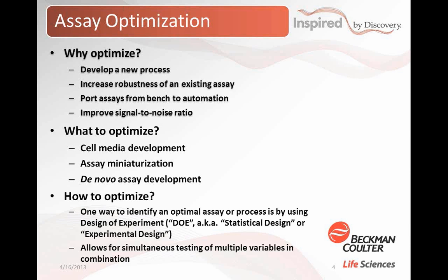One of the methodologies, and the one we're going to talk about today to do optimization, is called design of experiments. Traditionally, there's no S on the end, but it's easy to throw that in there. It's also known as DOE, or statistical design, or statistical experimental design, lots of words. But basically, this is a tool that's been used very prevalently in the automotive industry, to try to test several variables at the same time and see how those work and see the effects.